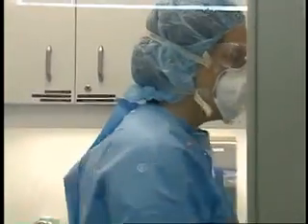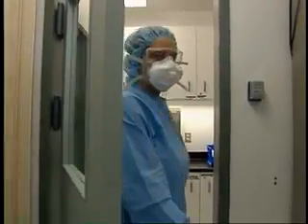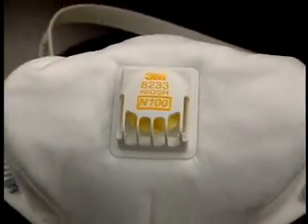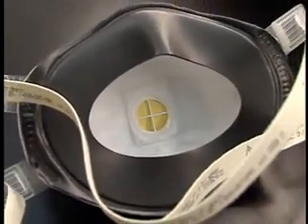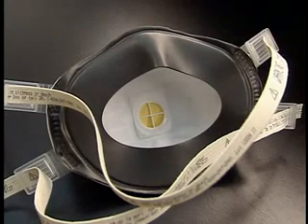When cleaning the biological safety cabinet, wear a respirator mask with a high-efficiency filter, an N100 respirator mask, for example, to protect yourself from antineoplastic particles that might be present in the cabinet. You must also wear the respirator mask when cleaning up drug spills or decontaminating the cabinet.